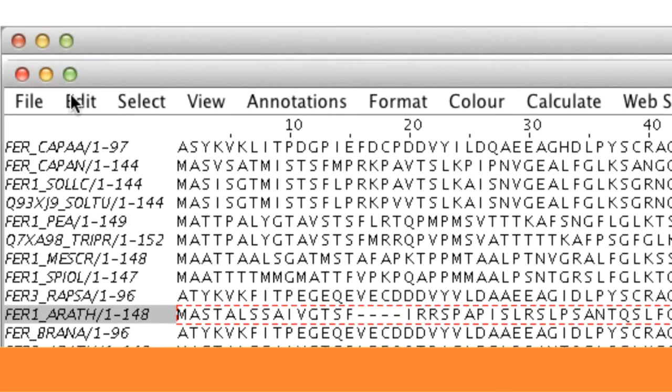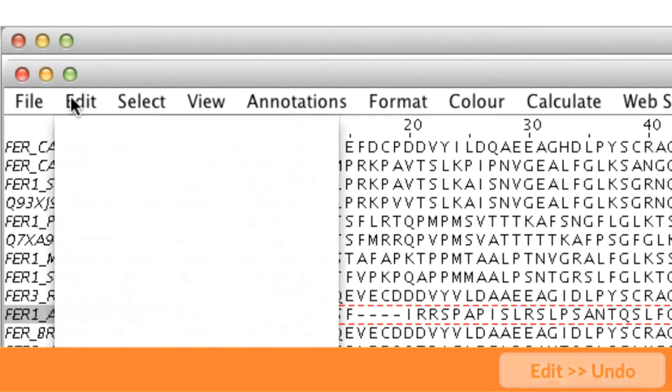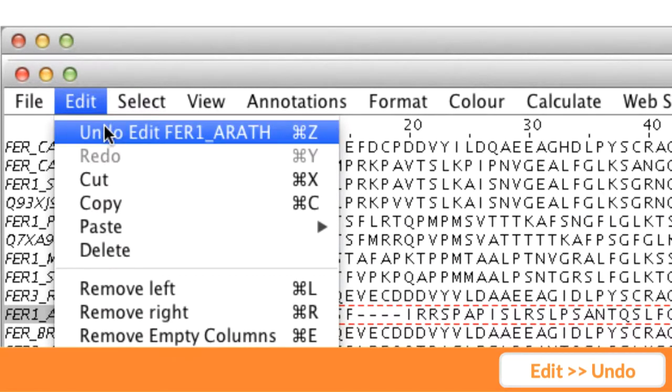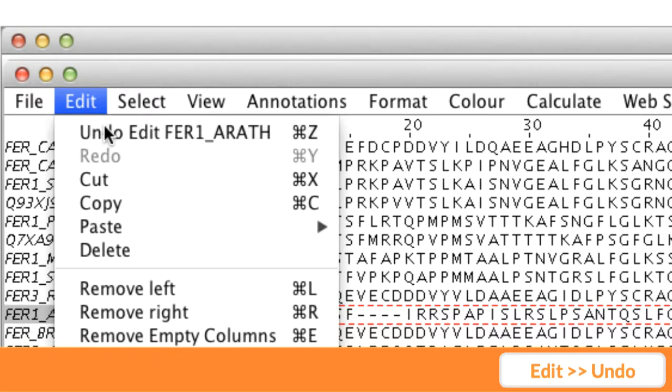To undo the editing, I go to the Edit menu of the alignment window and select Undo Edit.